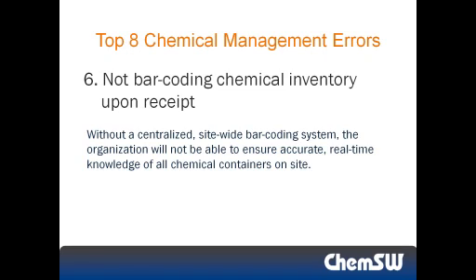Barcoding is the most efficient way to effectively maintain an active, real-time, up-to-date chemical inventory. Barcoding just speeds up the process of moving inventory, transferring ownership, and performing lab audits. And if it's easy and efficient to perform a lab audit, then you can do them more often, which in turn will give the organization a more current inventory that lab personnel can trust.